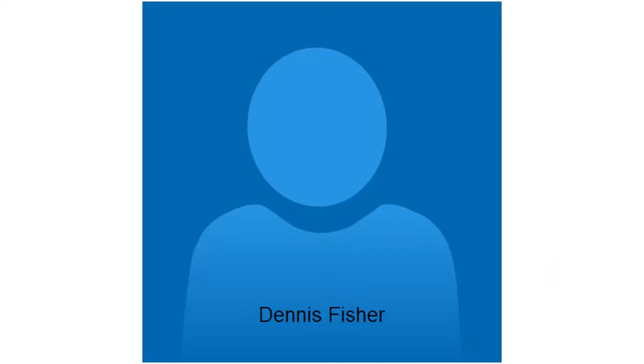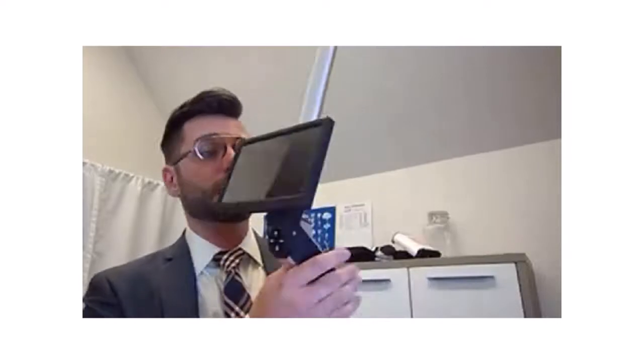Hello, can everybody hear me okay? All right, so I'm just going to do a quick demonstration of the instrument, how it works in the field, and then I'm going to open this up to questions so that we can get a better understanding of what you're looking for and what you'd like the instrument to do in your hands.